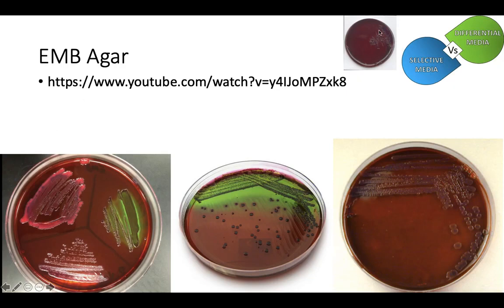So this is a really dark purple version, or kind of a pinkish bubblegum color. So everything other than E. coli, every other Enterobacter species, is going to uptake eosin, which gives them that purple color. Methylene blue for our E. coli, and that's the key here. That acidic byproduct makes their cell walls leaky. E. coli sucks up methylene blue. Everybody else sucks up eosin.